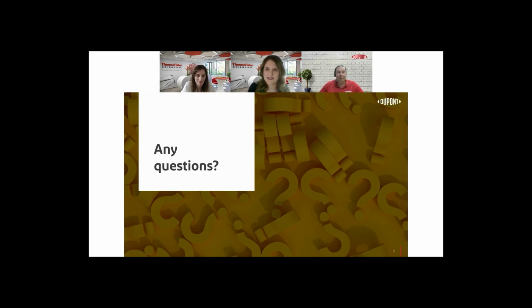Okay. Next question is, which accessories would you recommend for a laboratory spill kit? Yes. So in general, for a spill kit, what I would recommend is wearing a gown and a pair of overboots, because you're not wearing chemical protective boots in general in the laboratory. So what level of protection you need depends on the chemicals that are handled in your laboratory.